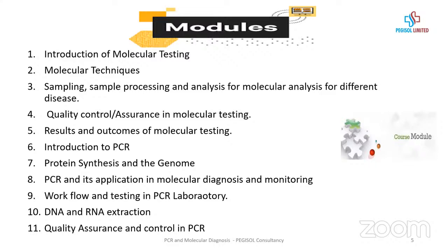So I'll be taking you on module 2, which is the molecular techniques. I am going to give you an outline of some of the techniques you can get in molecular. I think about 12 of them that I have, but I will take time to talk about PCR and then DNA extraction, which we'll do in practical. And we'll also look at the techniques of electrophoresis and how you can read your results and draw inference from each result you obtain based on the conventional PCR, and then how you can extrapolate and use that when you are using advanced techniques and the mid technique that has to do with things like real-time PCR.